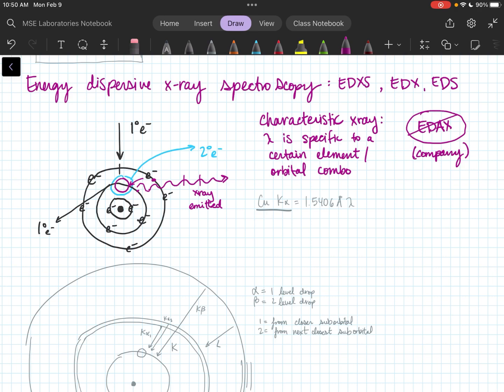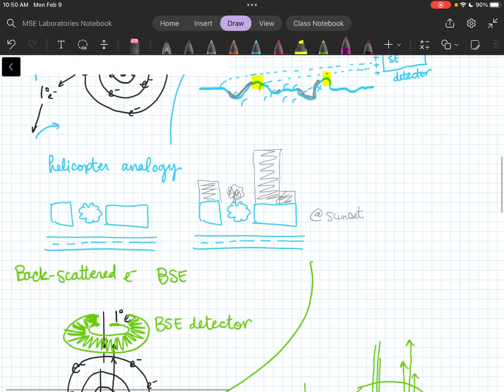But you can. If I'm shooting an electron at a thing, all 3 of these are happening, whether I see them or not. Similar to visible light existing whether I am blind or not. It's happening, whether I have the detectors for visible light built in is person to person.